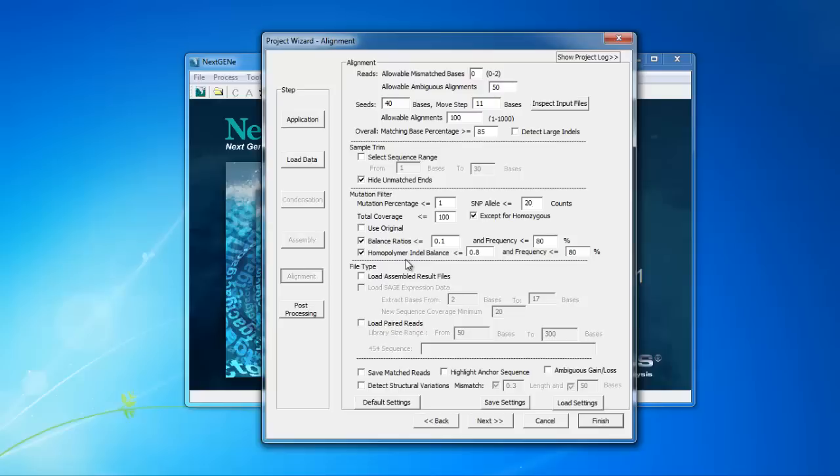The balance ratio setting checks the forward and reverse balance ratio for all variants and removes variants where the ratio is below the set threshold. The frequency setting allows this balance ratio check to be skipped for higher frequency variants.